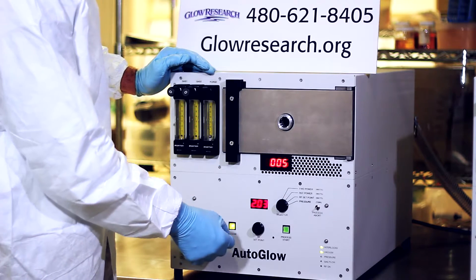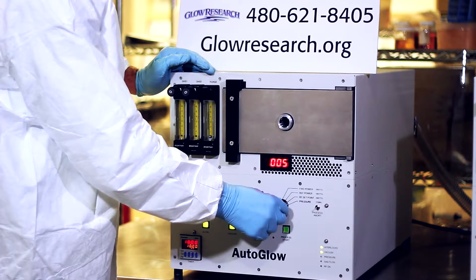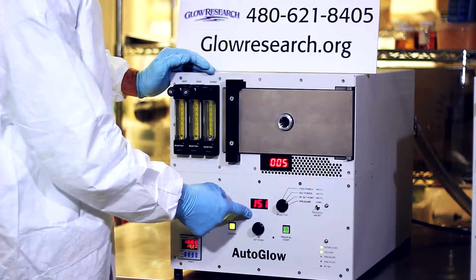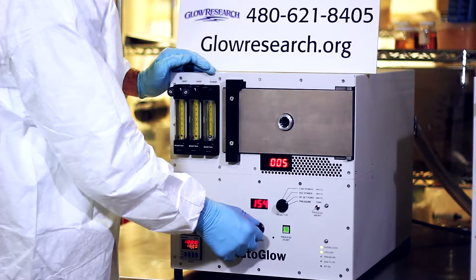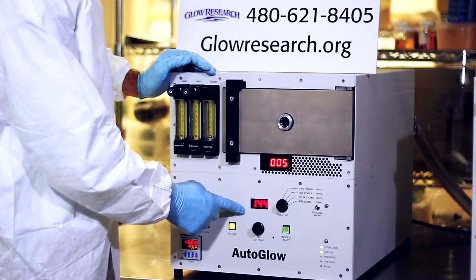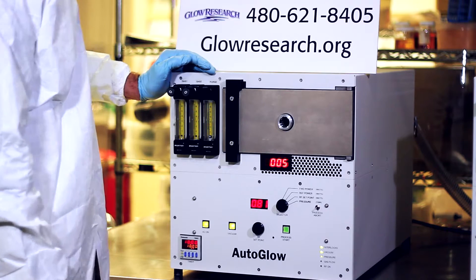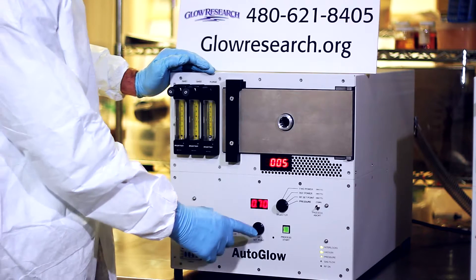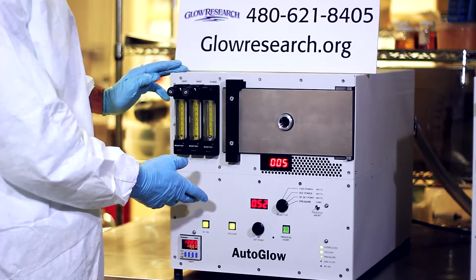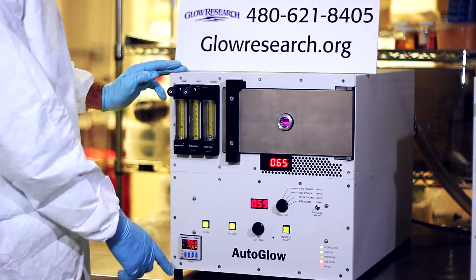The rugged RF generator is made by Glow Research and is rated to 300 watts. An optional 600 watt generator is available. The RF auto matching network module is made by Glow Research and is used in advanced production plasma systems. It is very reliable and tunes extremely fast regardless of the chamber load. The front display shows a reading for pressure, power, reflected power, and the actual power going into the chamber. Reflected power is extremely low due to the chamber design and the Glow Research matching network.